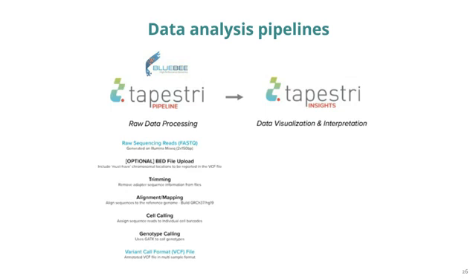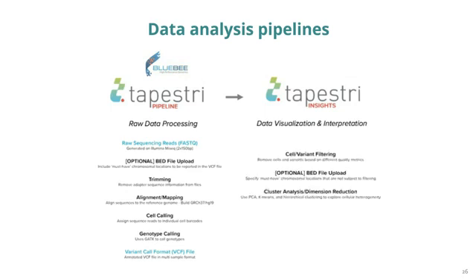And then these variants can be filtered in a second software, which is the Tapestri Insight. This is also a very useful software for reviewing the variants and also for a first exploratory analysis of the clonal architecture of the sample. Then you can export all the data, and further and more complex analysis can be done in other platforms like R or, for example, MATLAB.